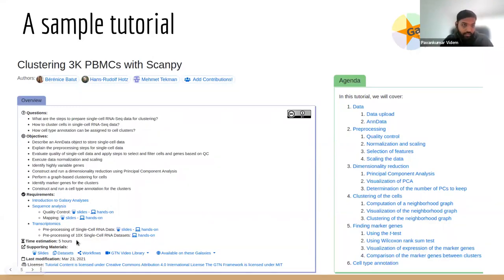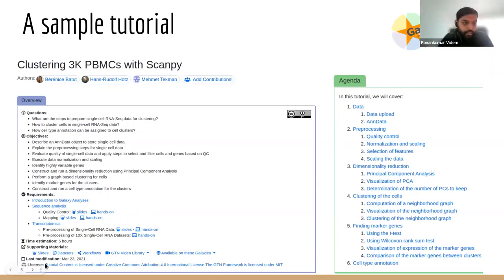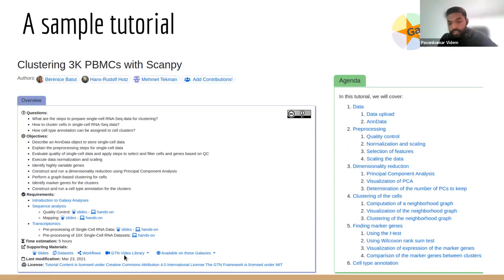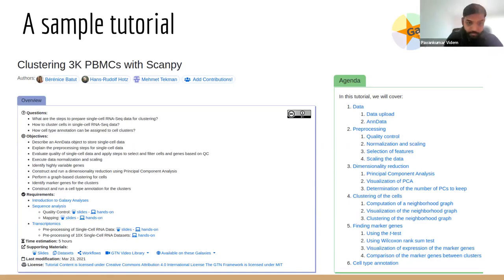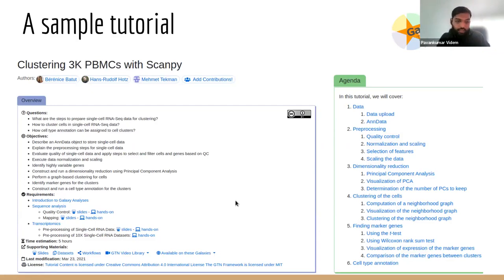We also provide a time estimate for how long this tutorial usually takes. There are lots of supporting materials, like slides, example datasets, workflows, and sometimes even videos of a complete training session recorded by the trainers. You can also see on which Galaxy instances you can run these tutorials.